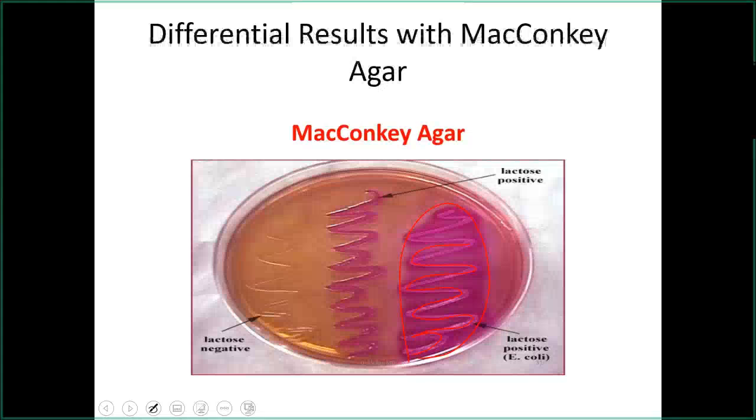And enzymes that get secreted into the surroundings are called exoenzymes. So there are a number of enzymes that could be at work there, lactose dehydrogenases and things like that, that the organism might have that it's using to digest that stuff.